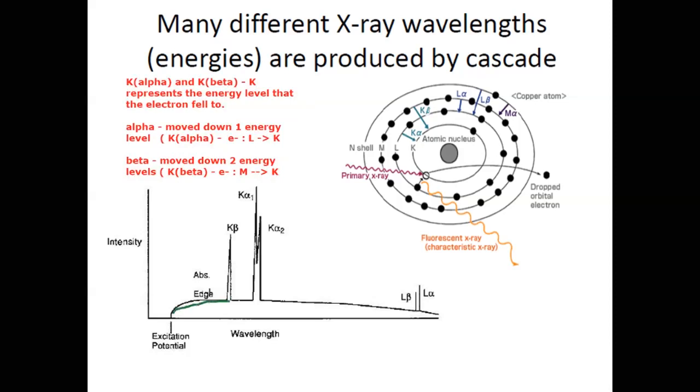This here that you see underneath, this is that Bremsstrahlung, I'll say BSL. So all of this absorption here that you see at the very bottom is due to the Bremsstrahlung X-rays. Now what we're interested in are the specific wavelengths where we see X-ray photons. So you see here we have K beta, we have K alpha, and you'll notice that it's K alpha 1 and 2. And we'll talk about what the difference between 1 and 2 is in just a moment.